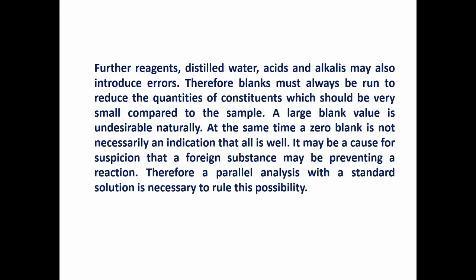Therefore, we must always run a blank. Whenever you want to do a spectrophotometric method, you have to have a sample and another as blank. Assuming this is the blank and this is the sample, the only difference between the blank and sample is the analyte.